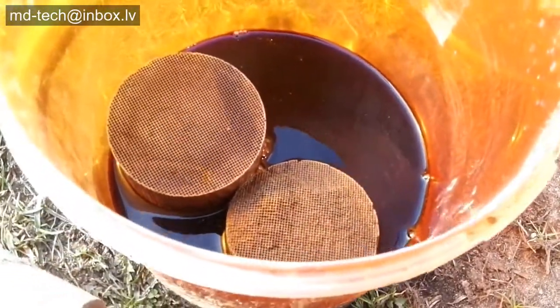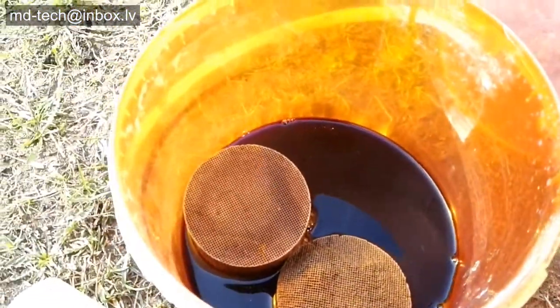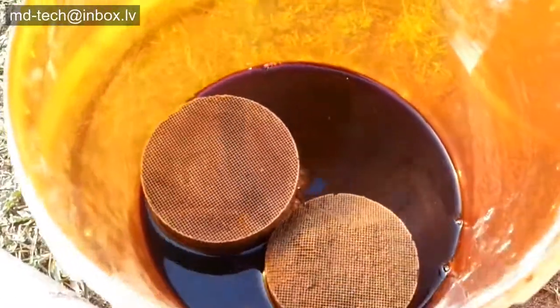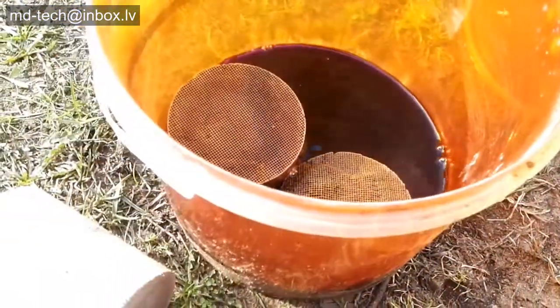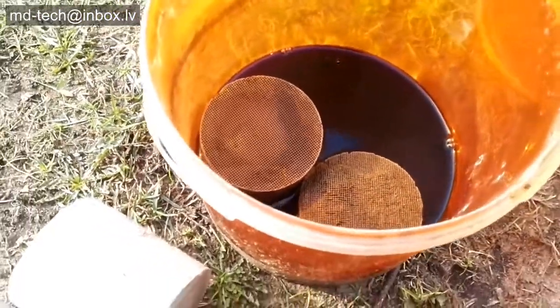Today I open the bucket with aqua regia. There is pressure inside still and a lot of chlorine gas. The solution color is significant of PGM content. The experiment is very good.